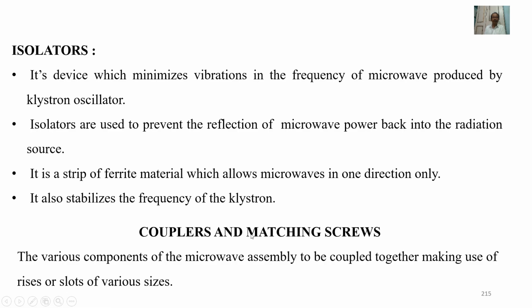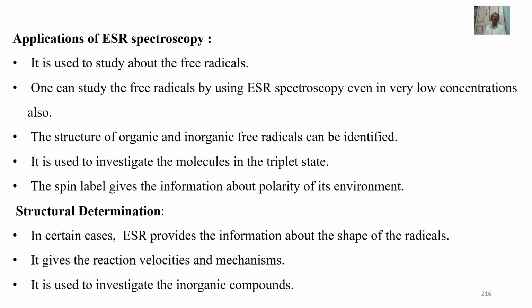Couplers and matching screws. The various components of the microwave assembly are coupled together, making use of irises or slots of various sizes. So now let us concentrate on applications of ESR spectroscopy. It is used to study free radicals. One can study free radicals by using ESR spectroscopy even in very low concentrations. The structure of organic and inorganic free radicals can be identified.